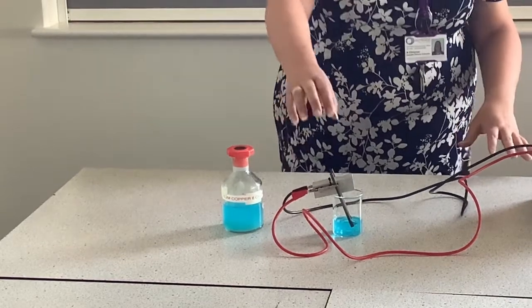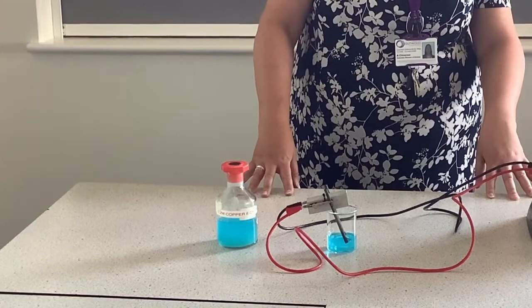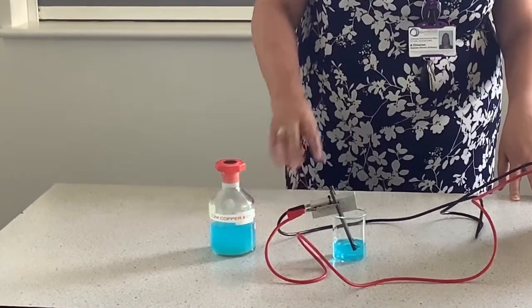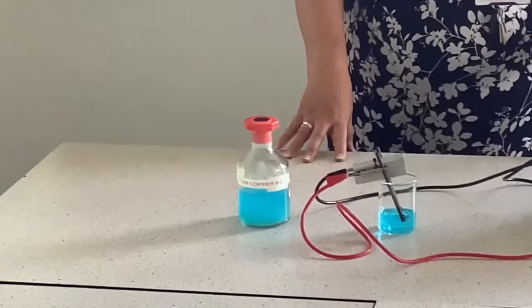Just checking that your electrodes are actually touching into your liquid, and then we're going to switch the power pack on, checking it's switched on at the wall as well. We will leave this running for a few minutes and you need to make careful observations. You should start to see something happening on the surface or near the surface of both of the electrodes.